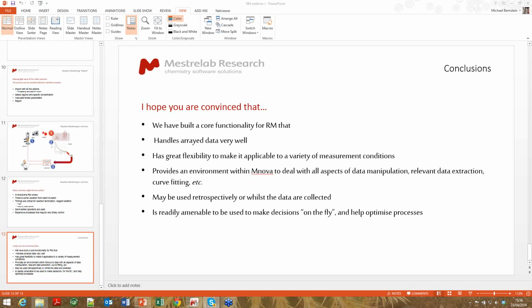Dan has asked, do the fits have to be sequentially numbered? No, I'm not entirely sure, Dan. I think not. I think it'll just go through them from a lower number to a higher number. I've certainly seen them not start at 1, but start at 500 or something like that.